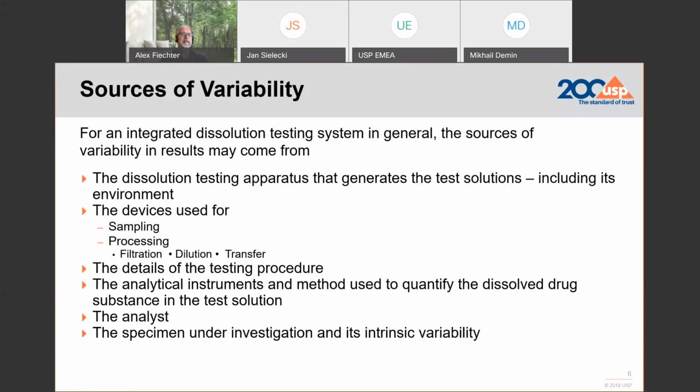Now, last but not least, the specimen itself. I mean, every tablet is a formulation, including the prednisone PVT tablet, and has its intrinsic variability. But I can assure you, when it comes to the prednisone tablet, in terms of weight variation and content variations, we have very, very strengthened and narrow specifications for the manufacturer who is producing the PVT tablet.